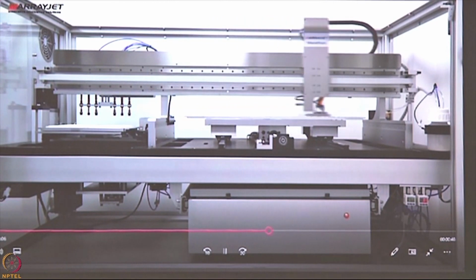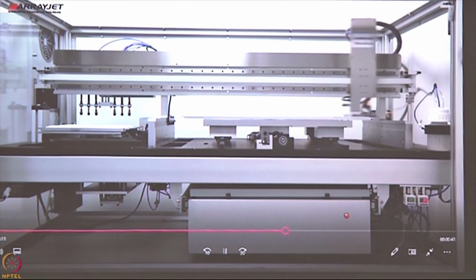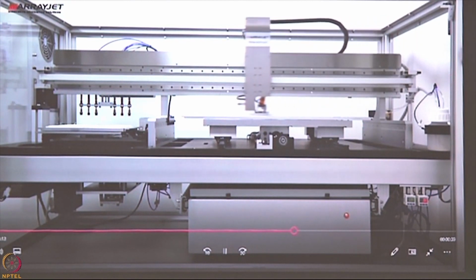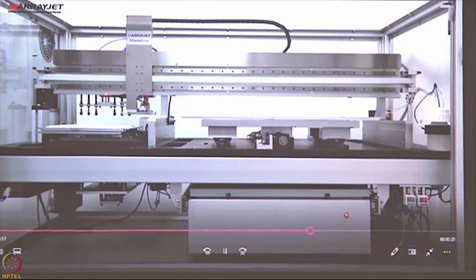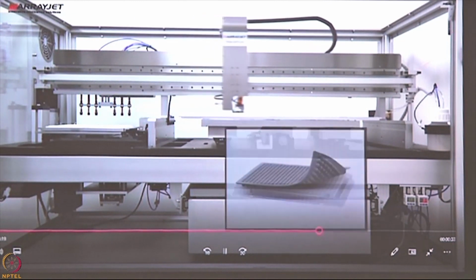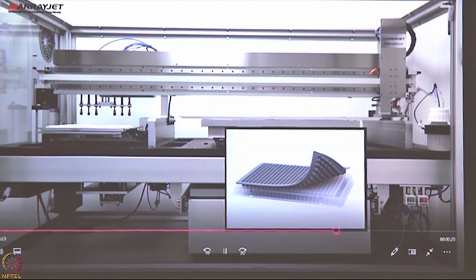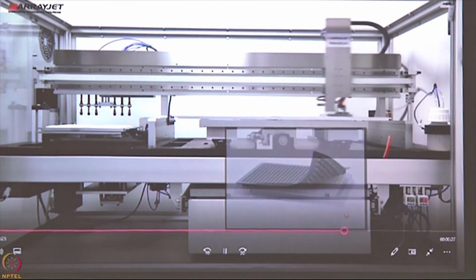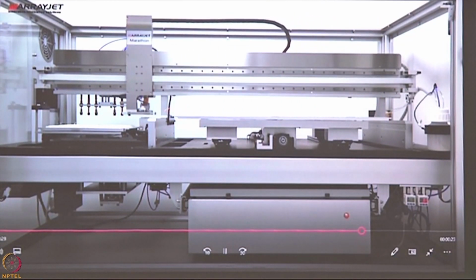And each time it is doing 12 samples at a time across 25 slides. That's your first tray done. Moves again, 12 samples at a time, second tray done. Moves again, 12 samples, third tray done. It's going to be less than 2 minutes for me to finish my 12 samples across 100 slides. So this is the quick motion. This is how quickly it moves as a printer.